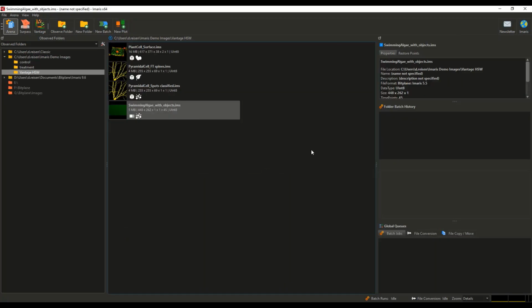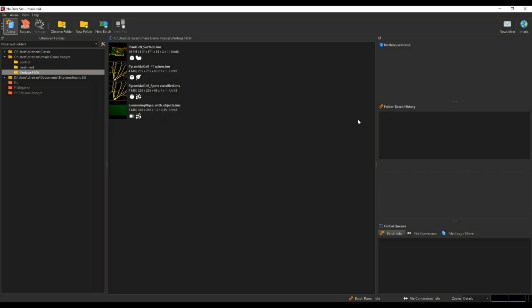I think we do have time now for some questions. So one of the questions, I was watching the questions as they were coming in, and one of the questions that popped up a few times was really that people wanted to make sure that you can make plots across multiple data sets. And I know, Daniel, you talked about that in the presentation. I don't know if there's anything, since you were looking at some of the questions too, if there was anything else you wanted to add?